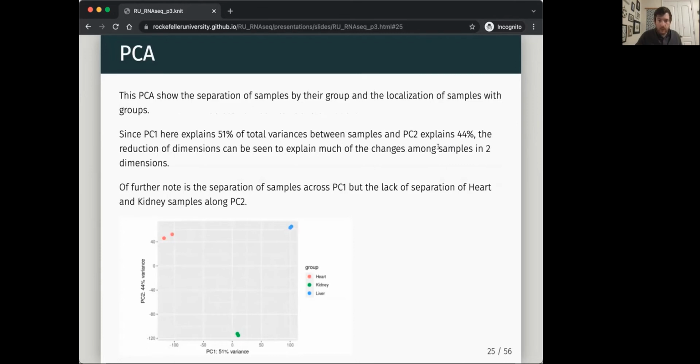Yeah, so this is kind of what I go into. Most of the variation is covered between PC1 and PC2, and they have inherently different things that they're contributing to.